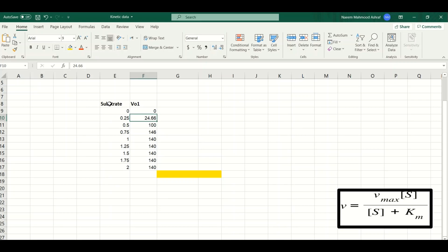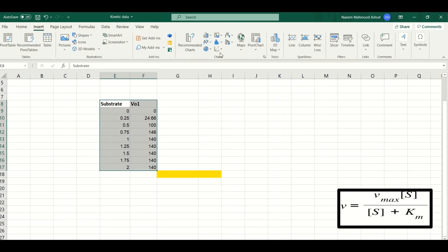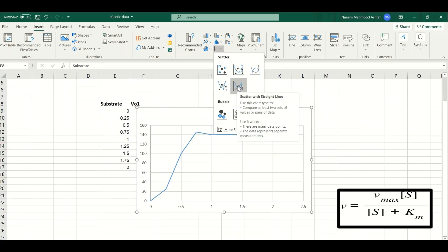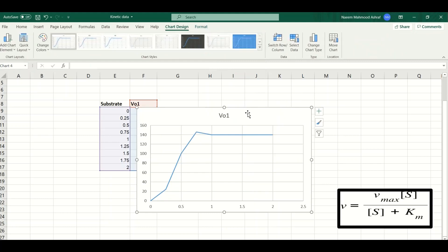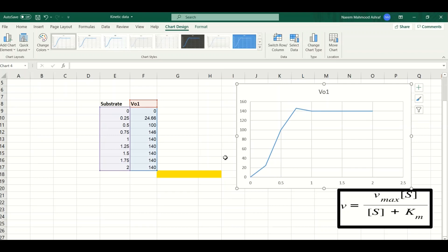To calculate the Vmax and Km, we will first draw a line plot between these two variables. To draw the line plot in Excel, we will select the two variables, go to the Insert tab, then go into the Chart portion and click on the line plot. As you can see, this is a line plot between substrate concentration on the x-axis and initial velocity on the y-axis.